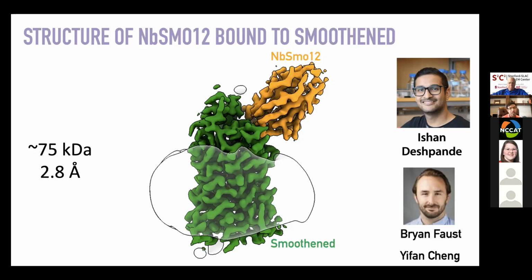I think the reason why this nanobody approach works really well is because almost all of the mass is very rigidly coupled to a 3-dimensional epitope on a protein, and that's why we think it drives particle alignment so well. And there are great examples of this, not just for GPCRs now, but for a number of other transporters, and certainly great examples of using full Fab fragments as well to drive particle alignment. So we think it's really a complex 3-dimensional epitope that enables this.